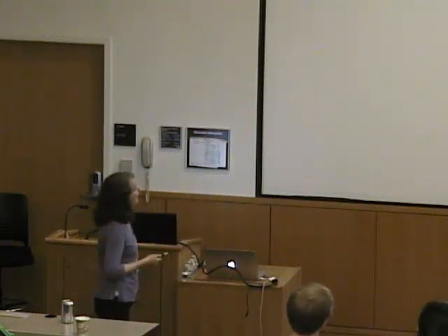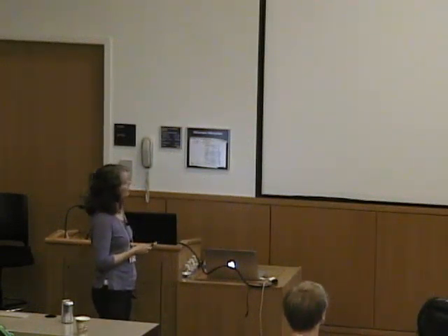But copper 2, it's really easy to get an EPR spectrum, and we all know that because you end up with those annoying copper peaks in all of your EPR spectra. But it's really hard to get an NMR spectrum of it, and that's directly related, among other things, to this tau S value. Especially it's very temperature dependent, though, of course. But although some systems are difficult, a number really show minimal line broadening, and I've summarized them here.